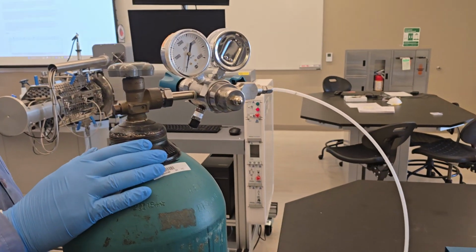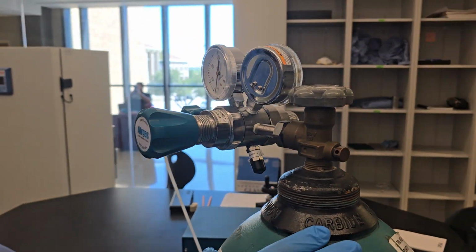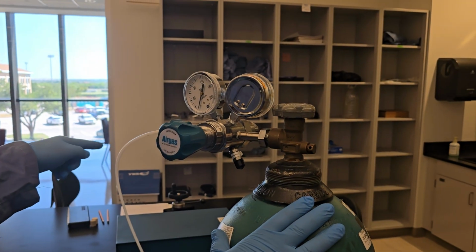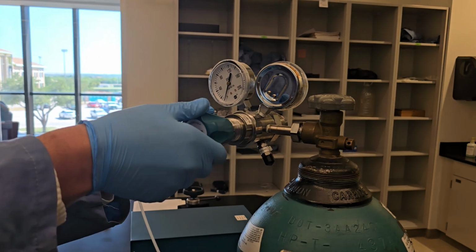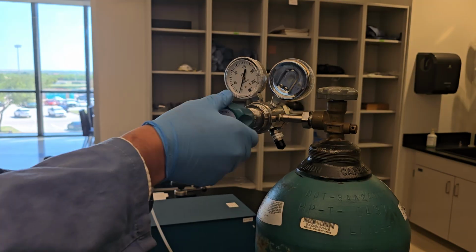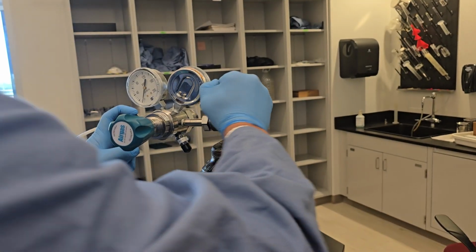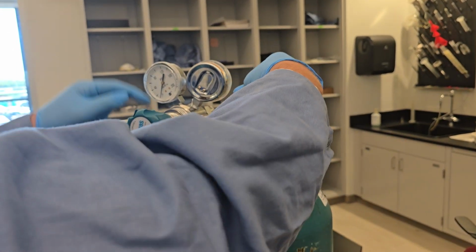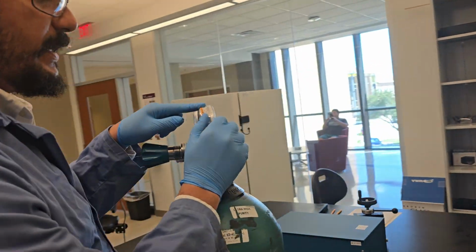So I come here and we have 3 valves. The main valve for the cylinder, the small valve connects it to the equipment, and the regulator. So first thing is to open the regulator all the way anti-clockwise. Second, we open this valve, the main valve for the gas cylinder, and check how much pressure. So if you can read here, how much pressure does the cylinder have.